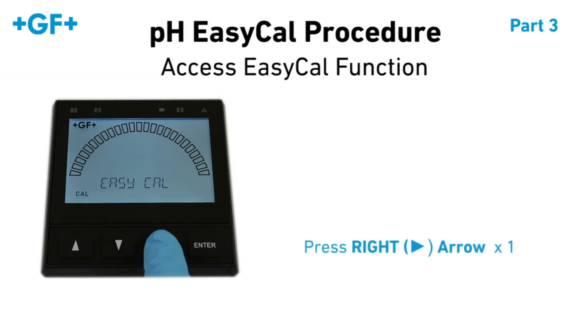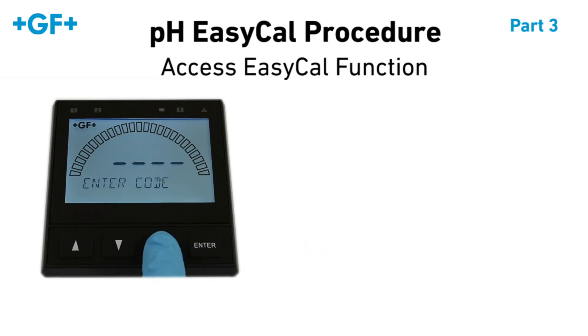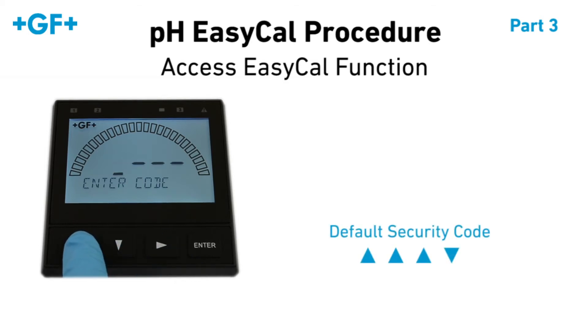Press the right arrow once to activate the EasyCal function. You may be required to enter your security code. The factory default is up, up, up, down.